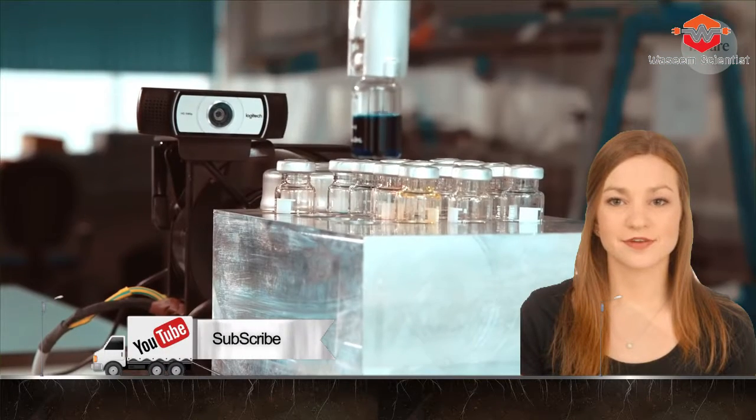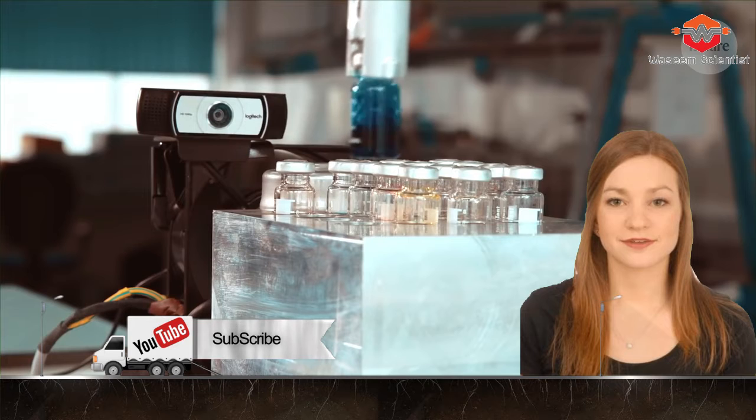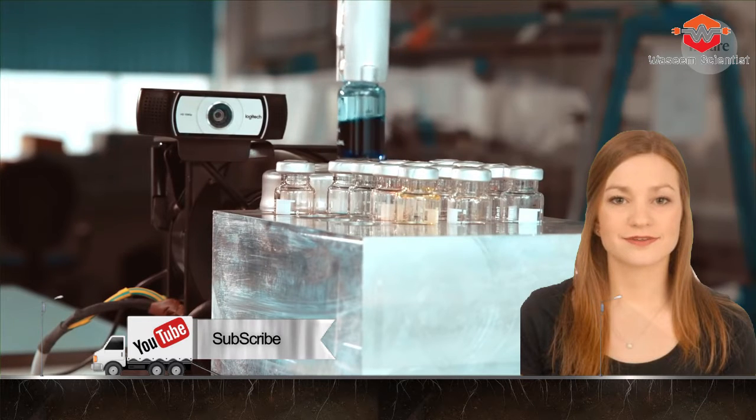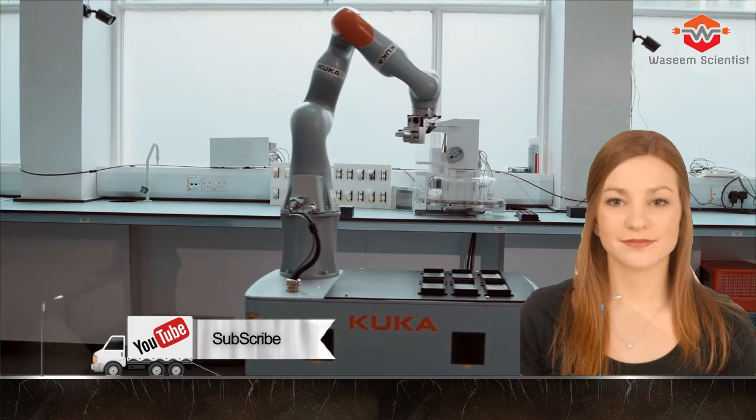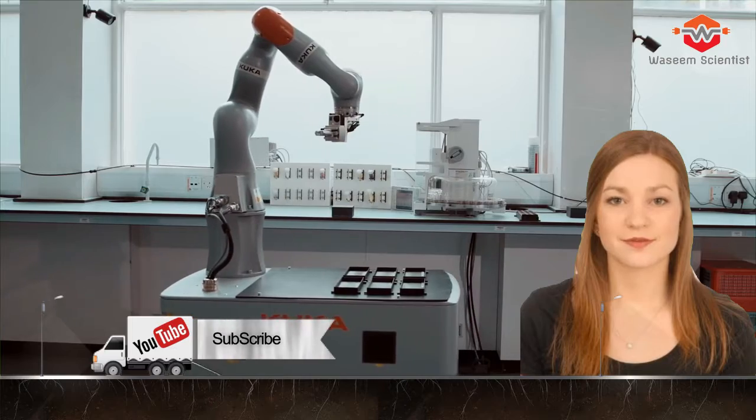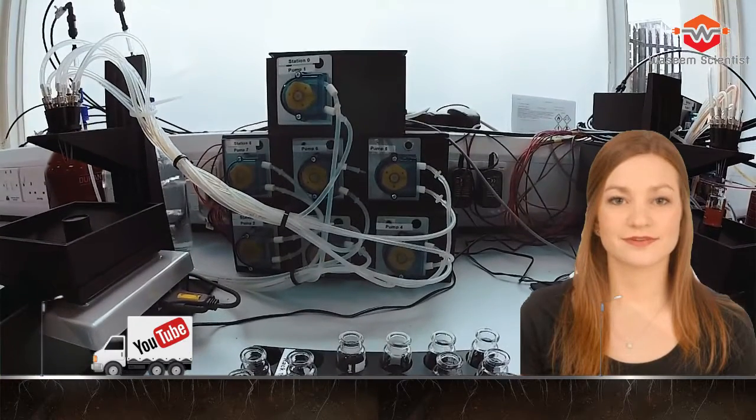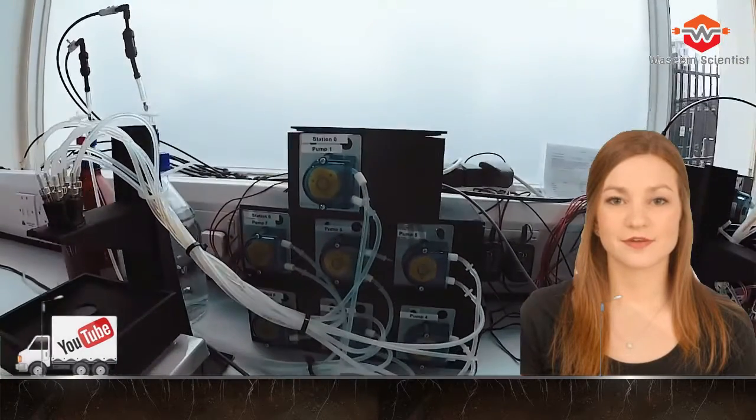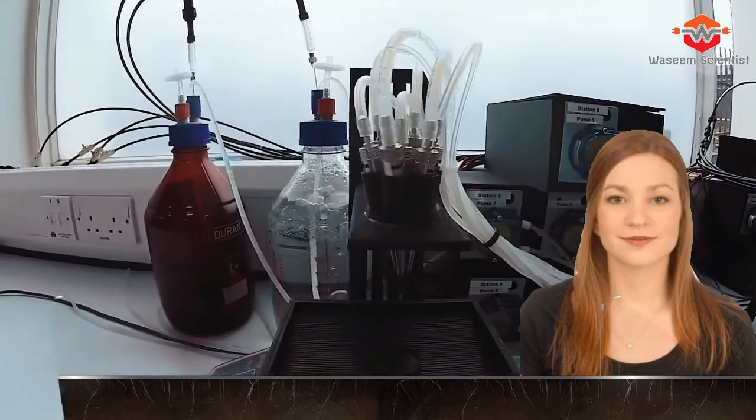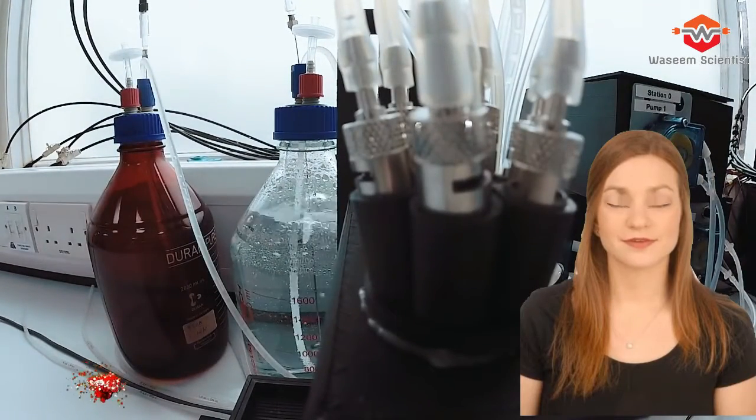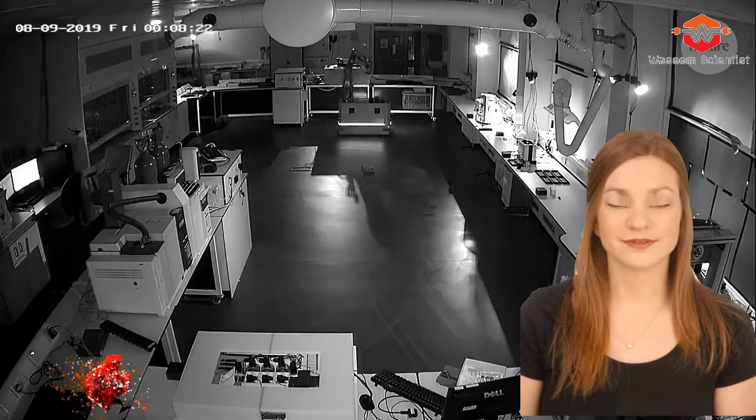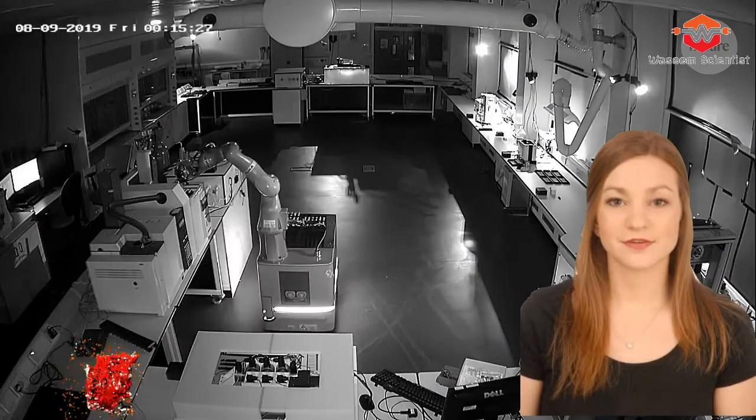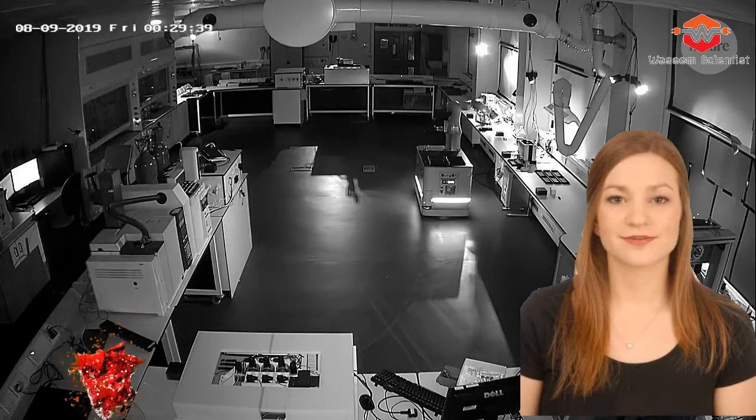The robot rolls around the lab thanks to a lidar system for detection, much like those used in autonomous cars, and is programmed with coordinates for several workstations where specific tasks are carried out. And once it gets to a workstation, it positions itself more precisely over the equipment using touch feedback by tapping on carefully placed rubber squares.